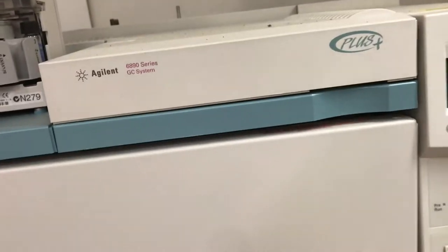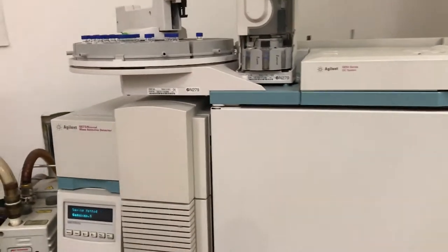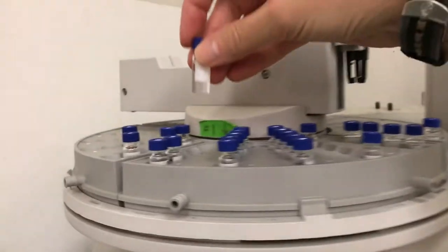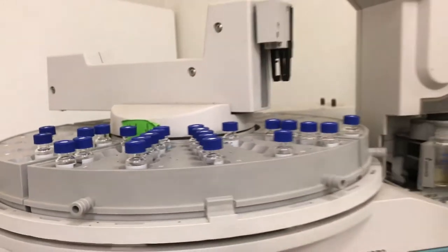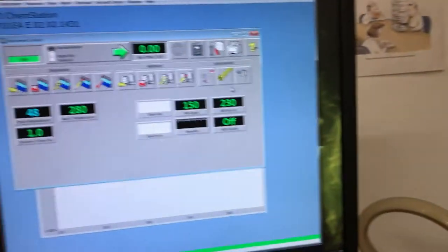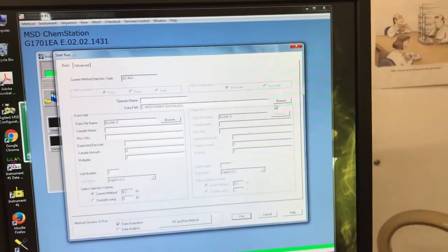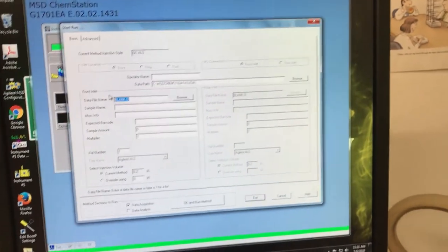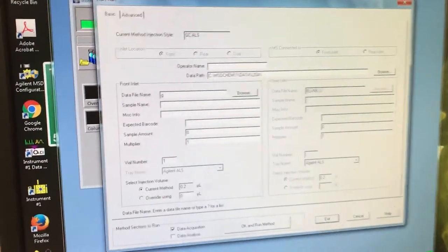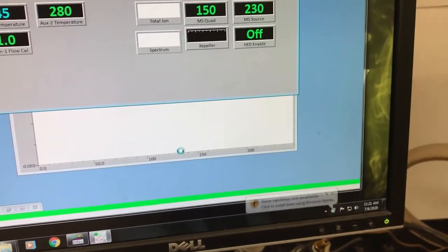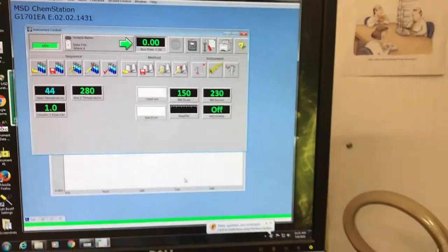Okay so here I'm going to stick my diluted sample into the turnstile and then go to the computer. I first just push on that arrow and I'm going to change the file name. Here I'll just write gasoline. And then you tell the machine to go. And that's it.